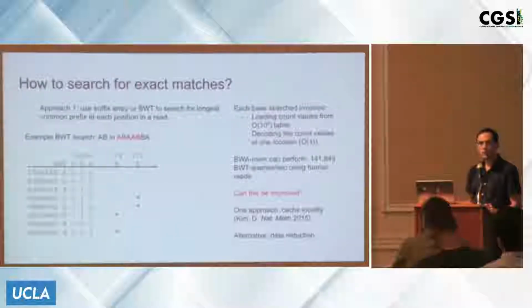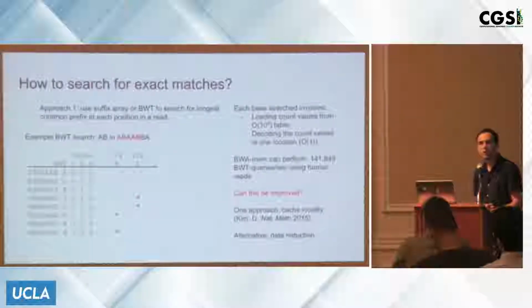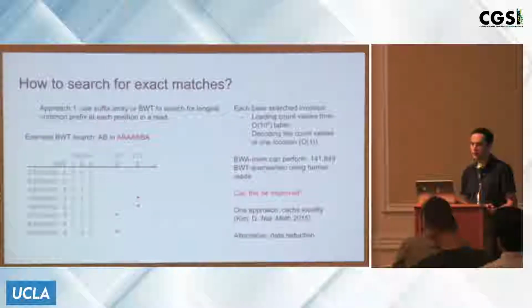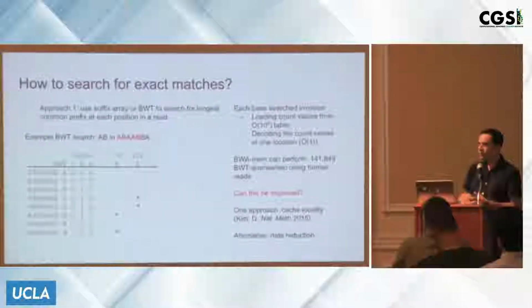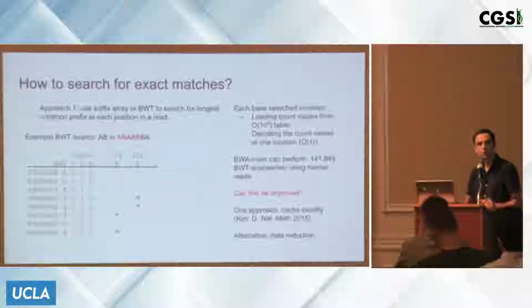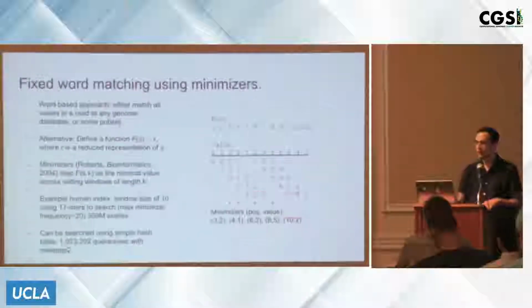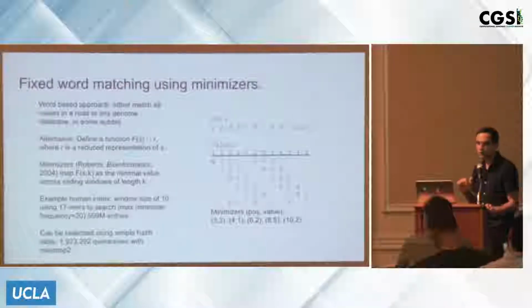One potential way to do a bit better is to improve the cache locality. This is something that was done for RNA sequencing reads with the HISAT2 aligner by Daehwan Kim. But that's not necessarily the approach that we'd like to have here. Maybe we could have something that's strictly using a hash-based method to compare sequences. The reason being is that we have longer and more accurate sequences, so we don't have to use this sort of tree type of search in order to find alignments.